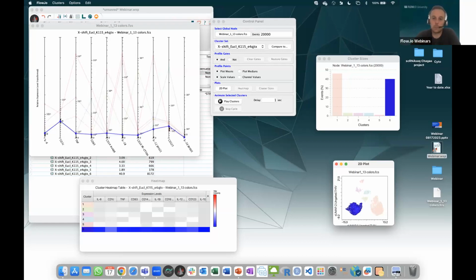I recommend using opt-SNE, because with opt-SNE you don't have to change many other parameters, it's just perplexity and iterations. Iteration in opt-SNE is going to stop as soon as it doesn't find any optimization from doing more calculation. So you can put a big number on the iteration. It's not a big deal. If at 500 iterations it doesn't find any improvement, it's just going to stop at 500, even if you put 2000.